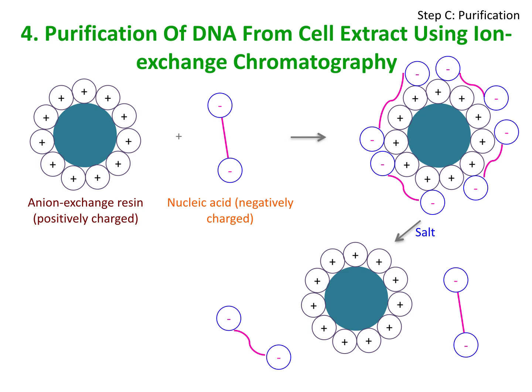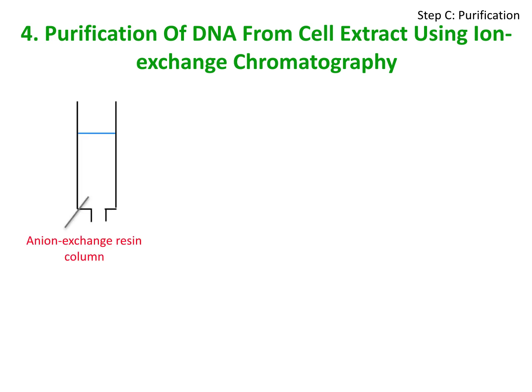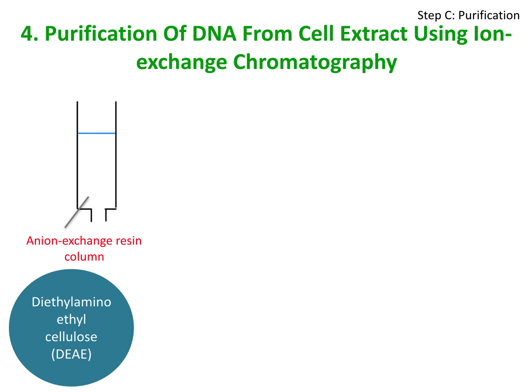In the first step of this procedure, we take a tube made of glass or plastic and insert a resin into it, basically forming a column of resin inside the tube. The resin that is used is a positively charged molecule called diethyl amino ethyl cellulose, in short DEAE. The cell extract is added on top of this column. This cell extract does not contain any salt. So, all the negatively charged molecules bind to the resin.